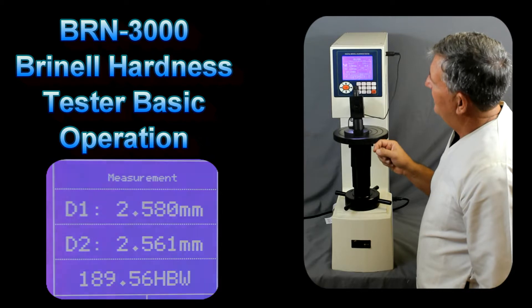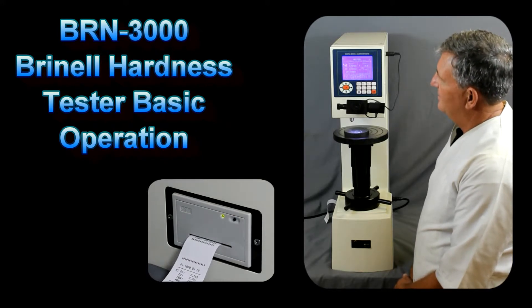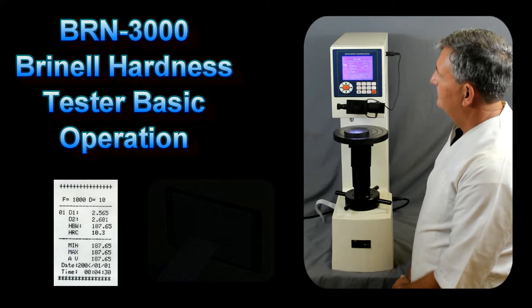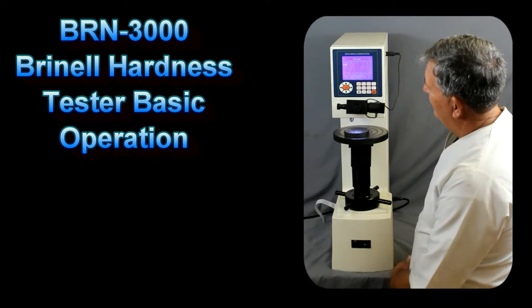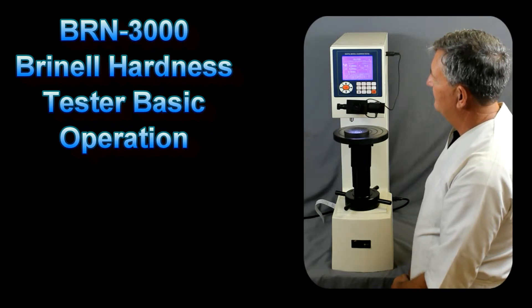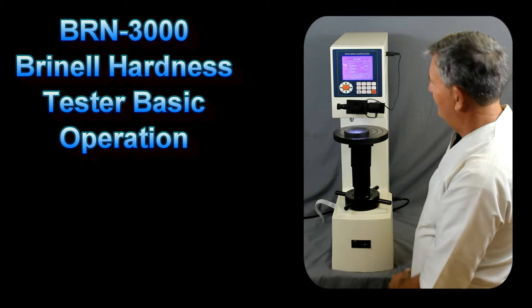This will now display our hardness value. If we wanted to print the values after making multiple indents, we'd press the PRT button — you can hear the printer output the measurement values. We can also go into Tab B to show the results of the indents we've made. We can save up to five sets of data containing 20 readings each by pressing the save button, allowing us to store data for multiple samples. Once we're done, before turning off the unit, we press the exit button to disable the CPU, and then we can turn off the system.